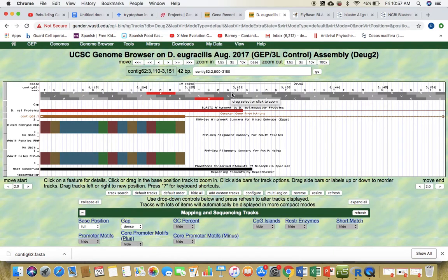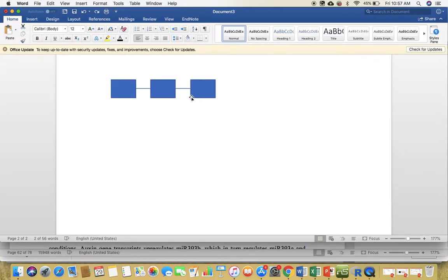Now there are a lot of GTs here. We have one here, we have one here, and we have one here. After I tested all of these GTs, now you have to meticulously test each one of them, to find the phase of every one of them for frame 2, to see which one could match up with the phase of the next one, of exon 3.